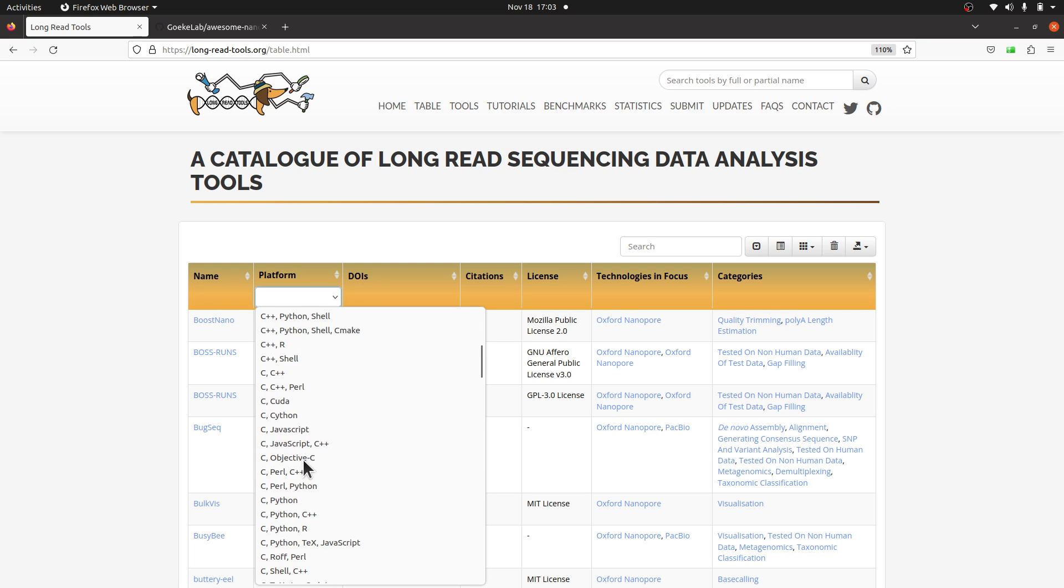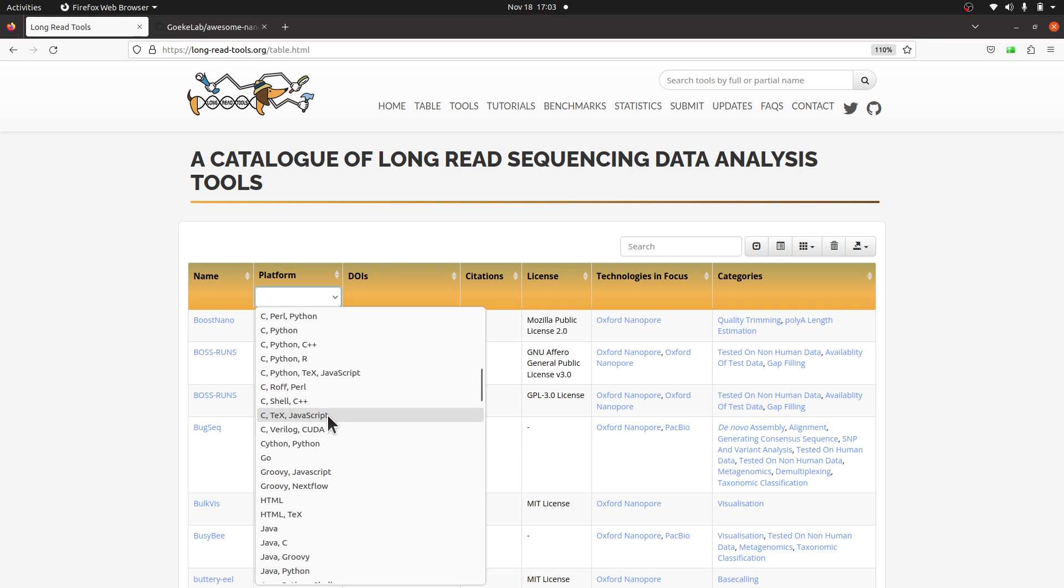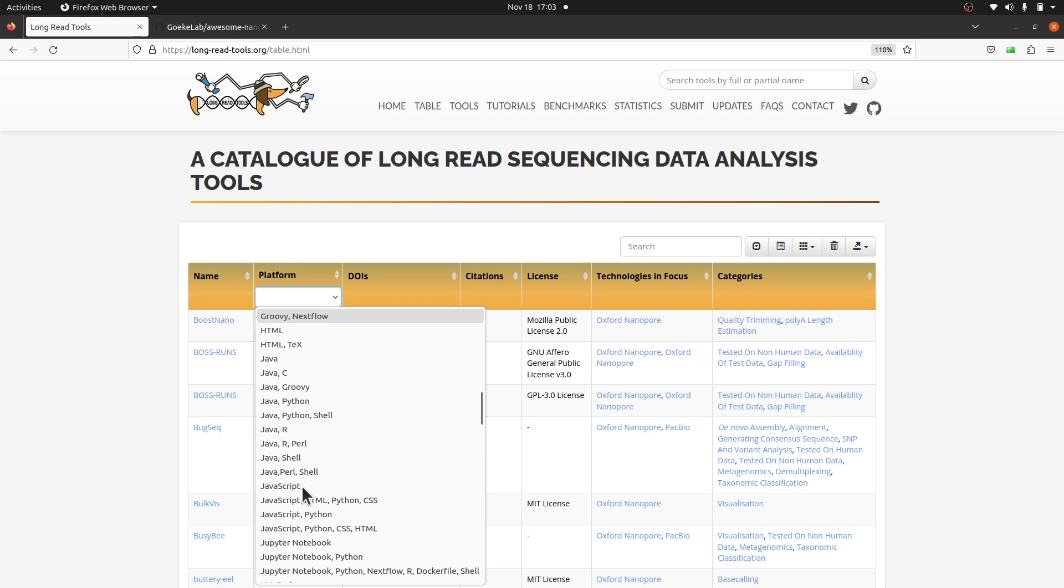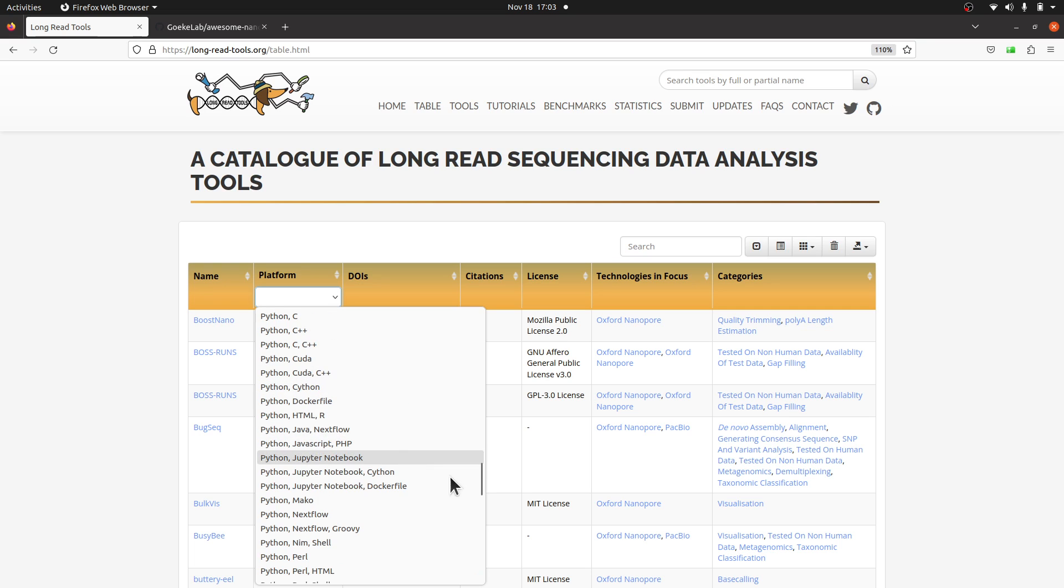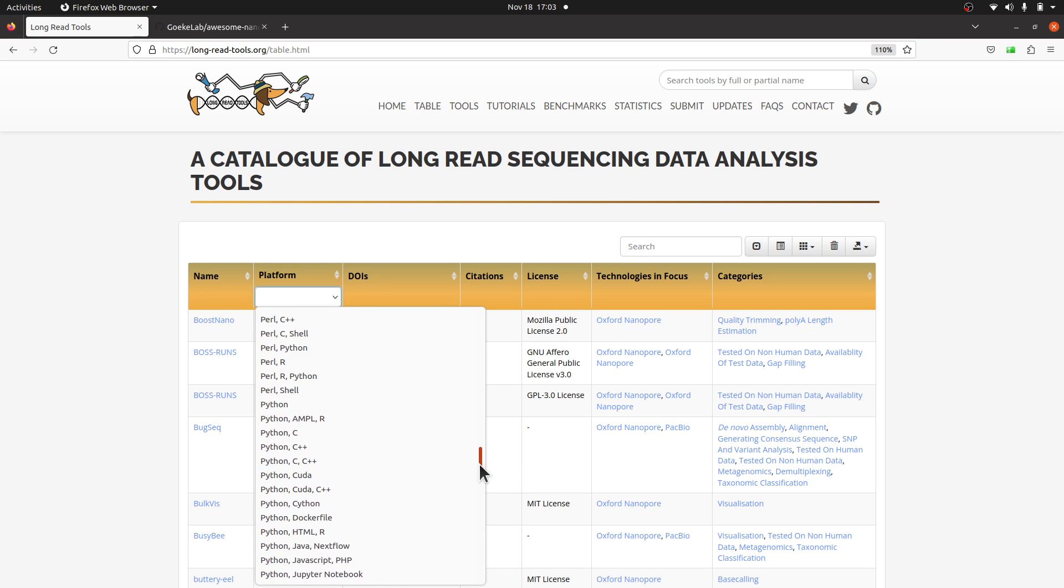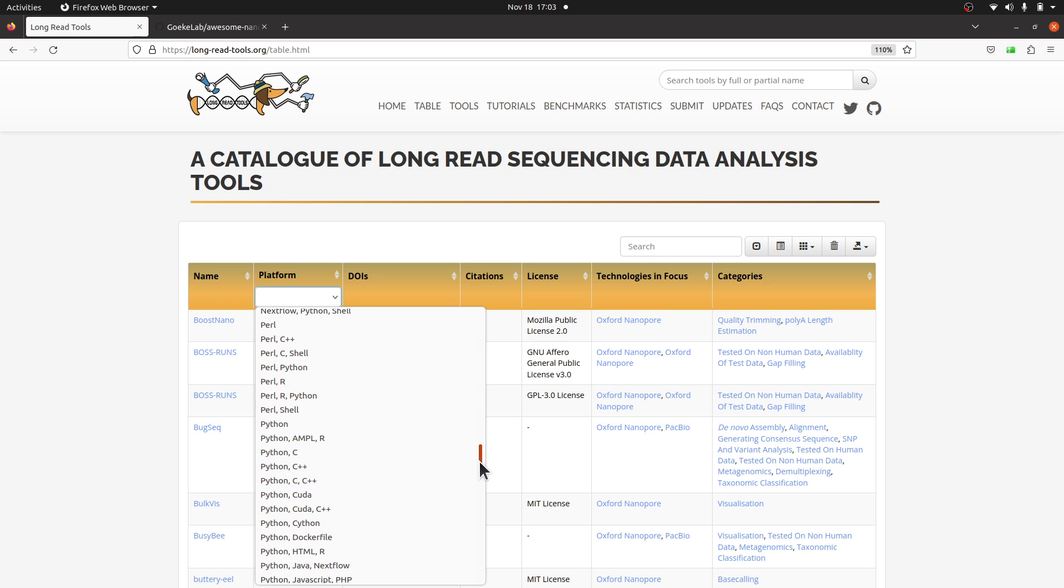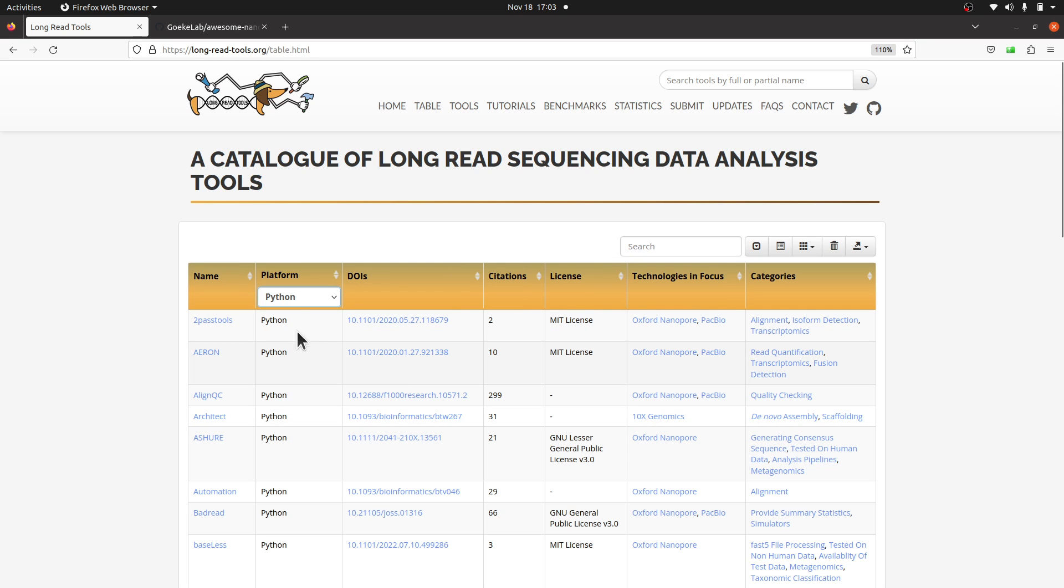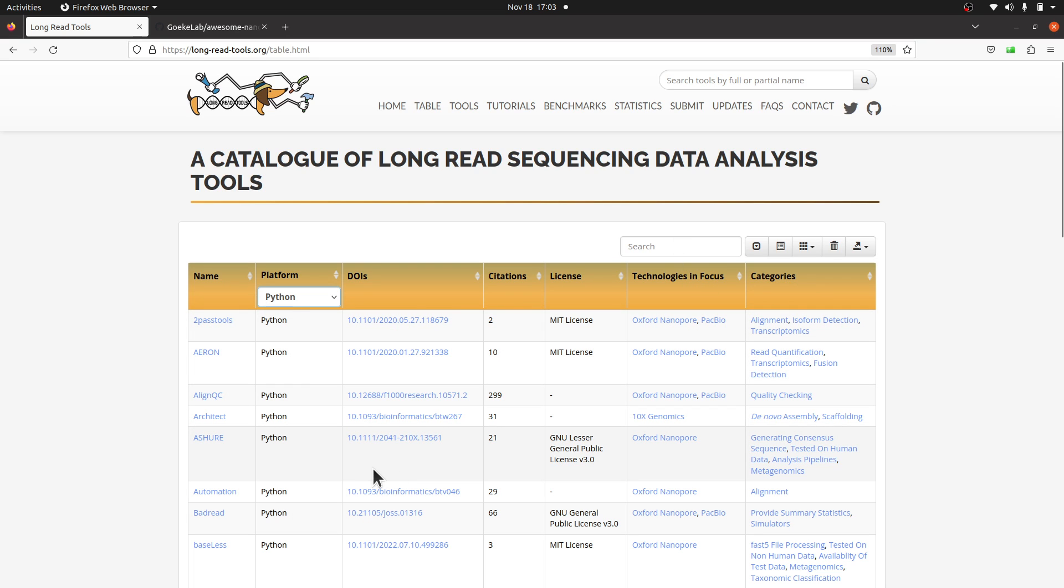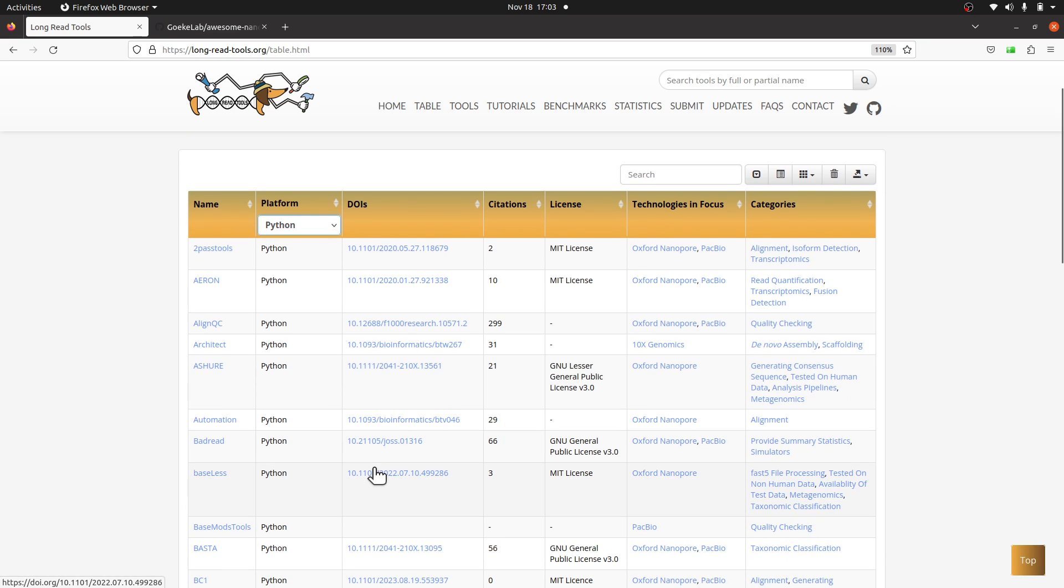Let's say we want a tool that was developed using Python or that uses Python to perform stats—just Python alone. Let's just check. When you click it, then you'll find all tools that were developed with Python or tools that probably require Python to run. And then you can check the categories, technologies in focus, etc. So this will help you filter or narrow down to tools that will suit your needs.